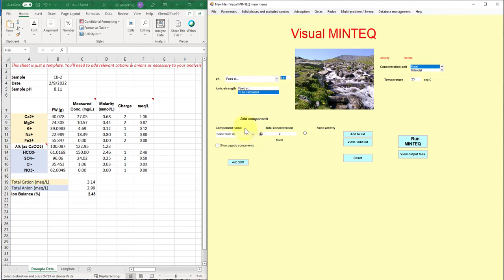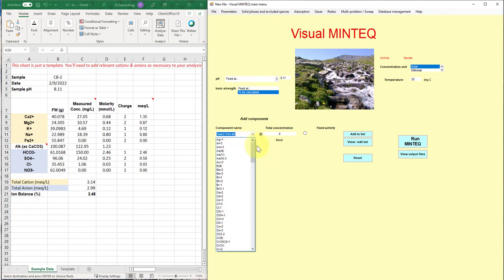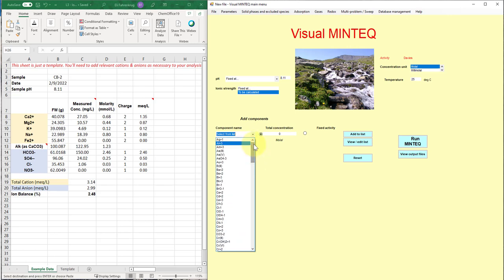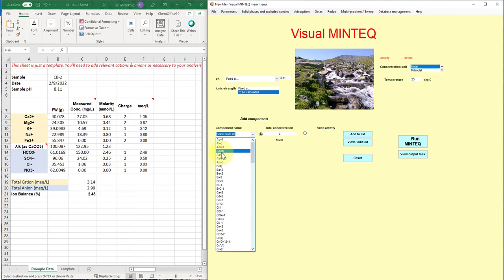Next, we need to add our components. And so components are similarly defined in Visual MINTEQ as they are in Hydra Medusa. A component, if you can see from the list, this doesn't have the periodic table like Hydra Medusa does, but it has similar operations. So there's at least one component for every element on the periodic table. And for some, there are more. And if there are more than one, that indicates an additional oxidation state of that particular component.